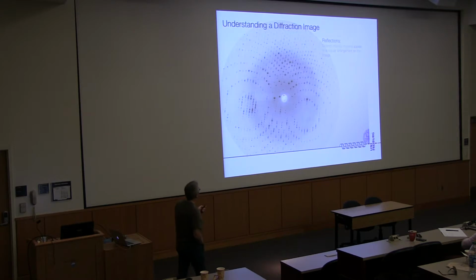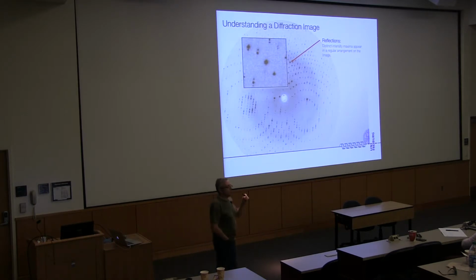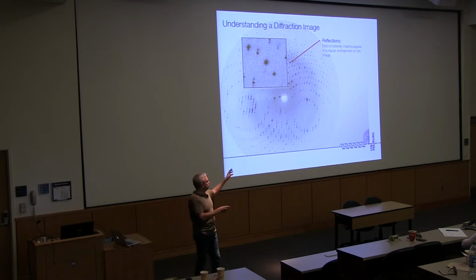And in this diffraction image, we have some features. The most important feature, obviously, are the black dots. And you now know these are maxima of constructive interference of the X-ray on the actual grid, which means you have a very high intensity, very much localized in a spot, and you just have background. You pretty much have nothing in between. One of these things is you turn the continuous information of a structure in space into a discrete information in Fourier space somewhere. You don't have information at every point here, only where the maxima are. Okay.